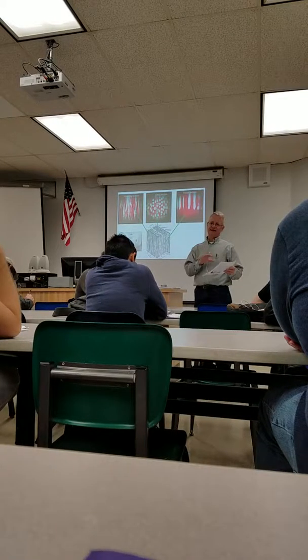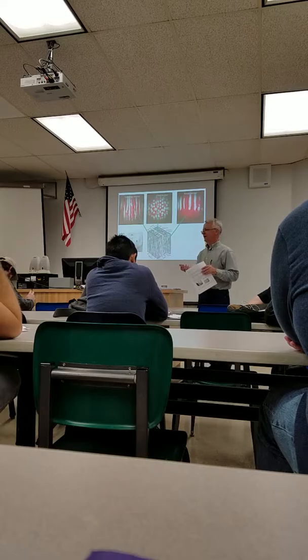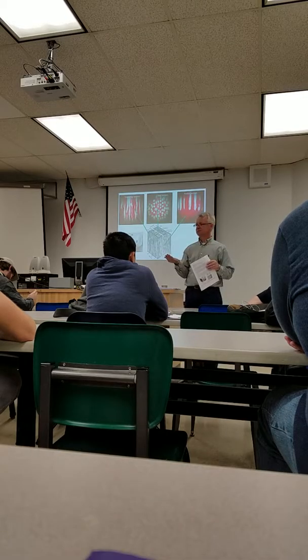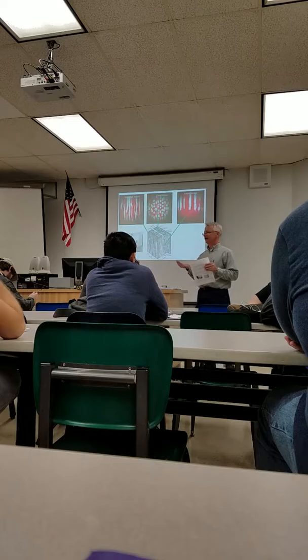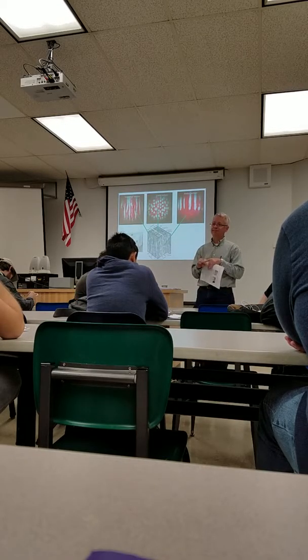On the cellular differences in those different types that you see. Will you label a growth ring in the corn image? No, it's a monocot. It doesn't have secondary growth, right? But it'll have vascular bundles with phloem and xylem in them. Okay?